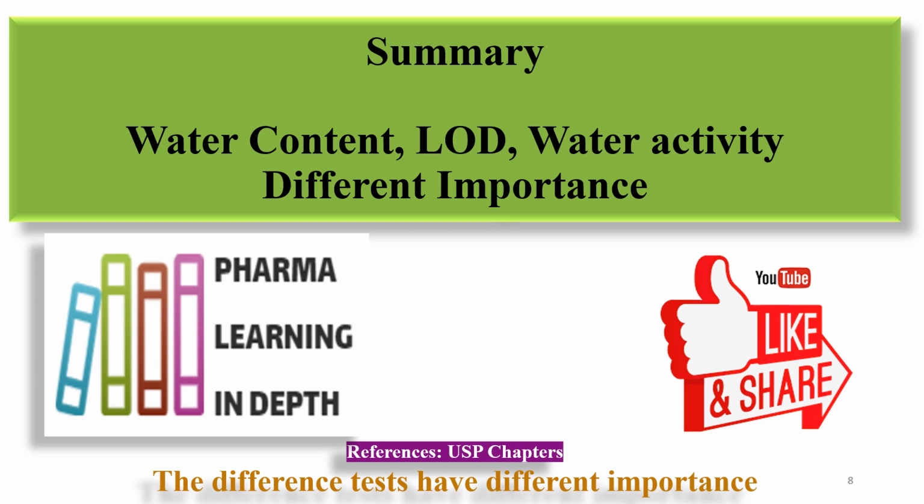Also, in some articles you can find that if the water activity is low, then by proper justification the micro testing can be omitted or skipped. So that is the importance of the water content, LOD, and water activity tests.